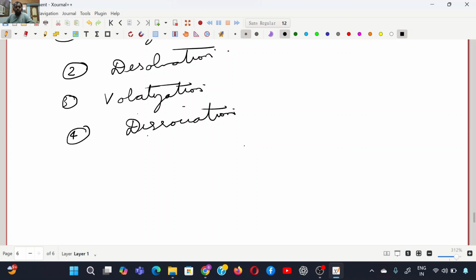In dissociation, the gaseous molecules break into free metal atoms. There can be competing side reactions also occurring, but that is not useful for AAS. Next is the atomic absorption step.